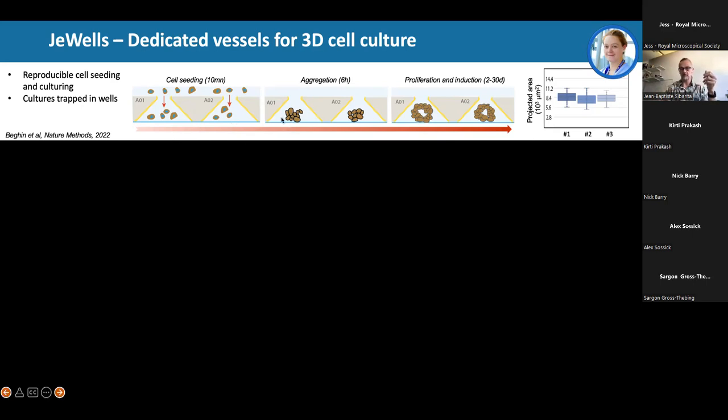You really have a glass coverslip, so you can do high resolution imaging. Even already by transmission light, you can guess your initial condition and maybe select the ones which are very similar. I know that in the field, people are very interested in the reproducibility of the initial condition. That's something that we discovered. Even here, there is a little variability in the growth process, but the statistics that we can get allow you to really pick similar initial conditions, maybe to make some phenotypic comparison and see how they develop depending on the initial condition.